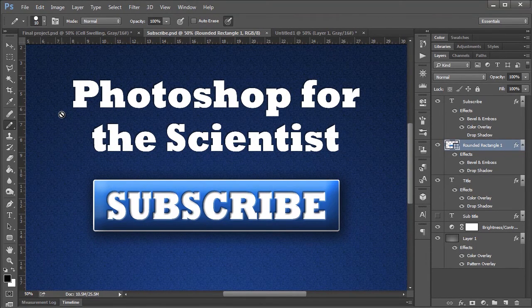So remember, you worked hard to get that time-lapse microscopy data, so why not work a little harder? And you don't even have to work that much harder. Just put them into Photoshop and make it into a video.